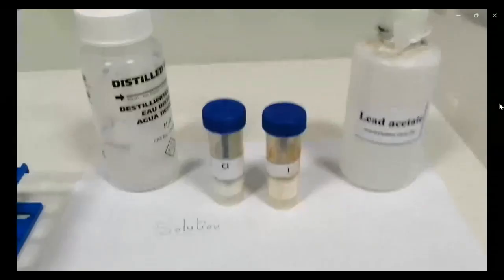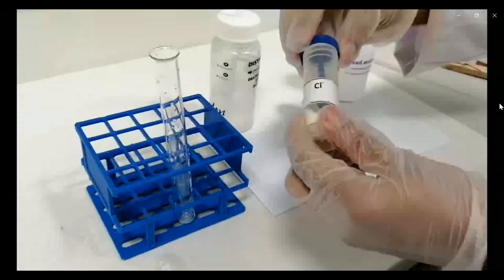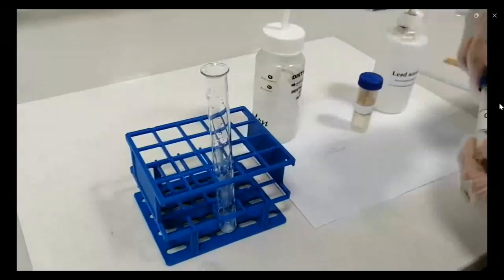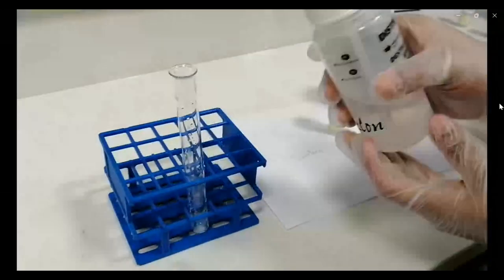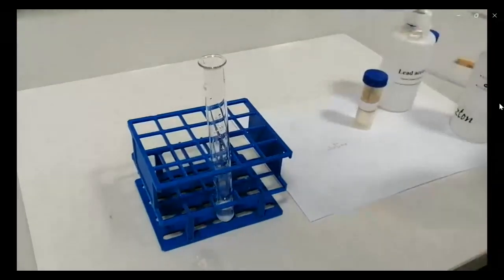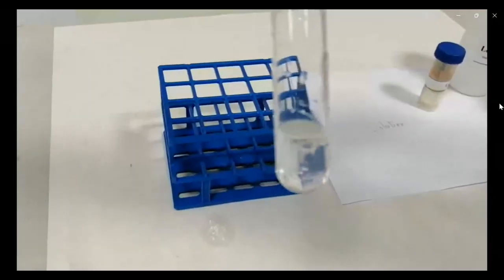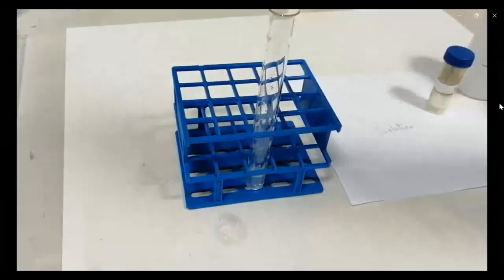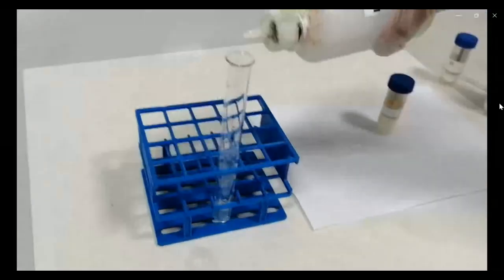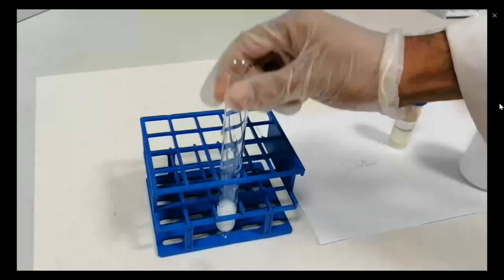The second confirmatory test is solution plus lead acetate. You have to prepare a solution first, a few crystals plus a few milliliters of water, and then add lead acetate. In case of chloride, you will see a white precipitate of lead chloride.